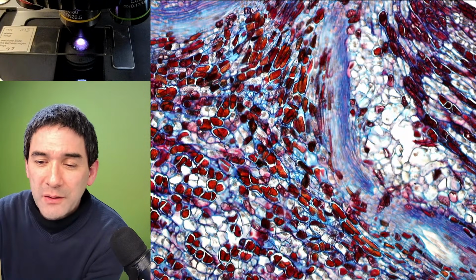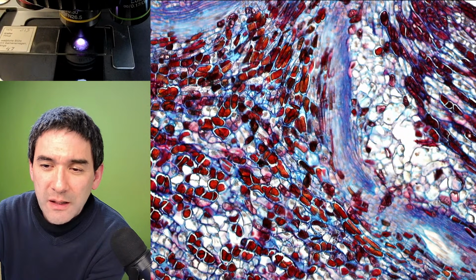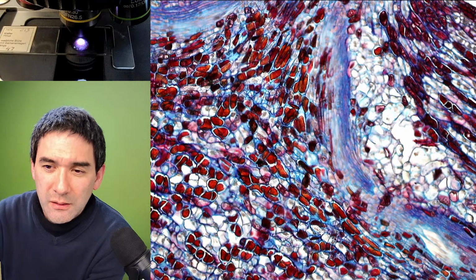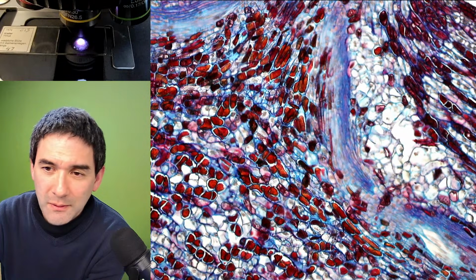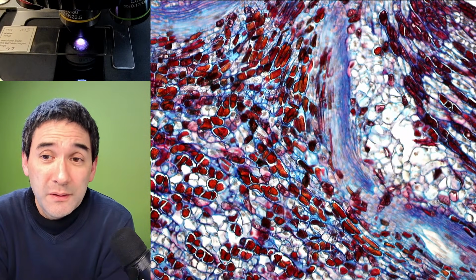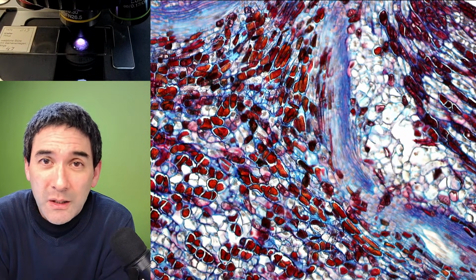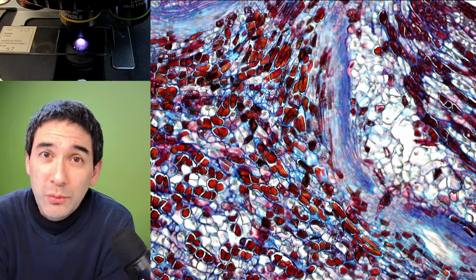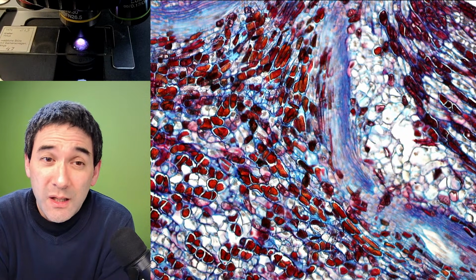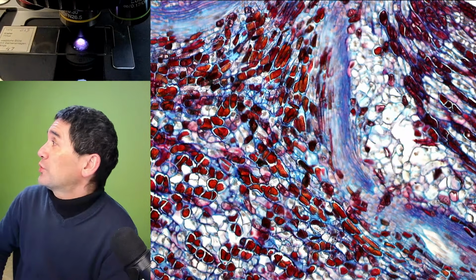What would be the best mounting medium to secure 5 specks of shiny metal in a deep slide? Oh my gosh, a shiny metal in a deep slide. I mean, generally, I don't know what the best is, but what I usually experiment around with, before you get any special mounting medium, is to use PVA glue. It's water-based. Yeah? This seems to work quite well in most cases. Yeah? Just want to show you.